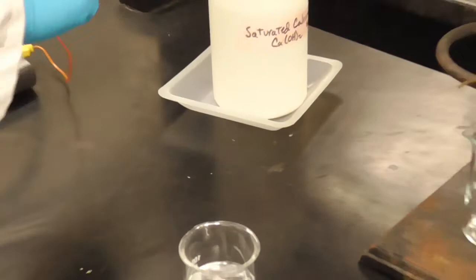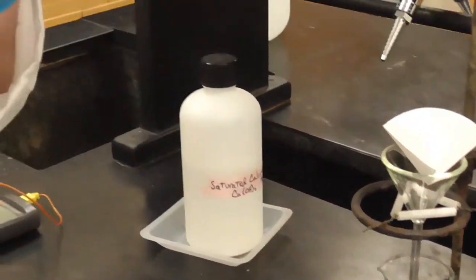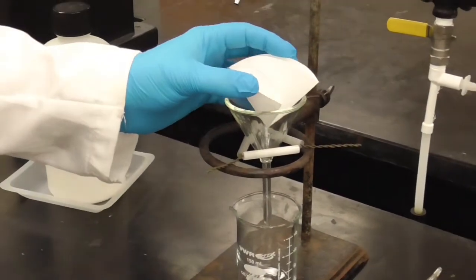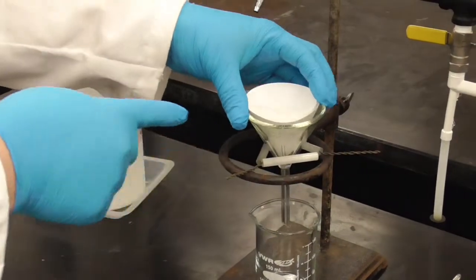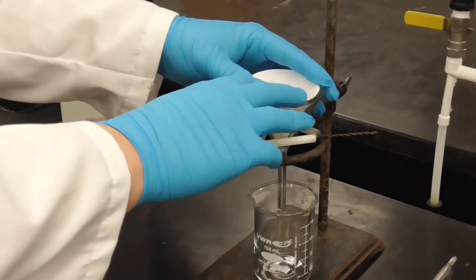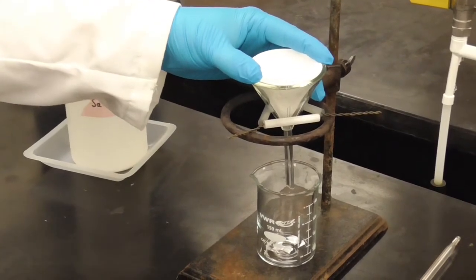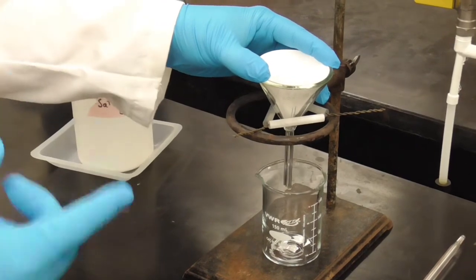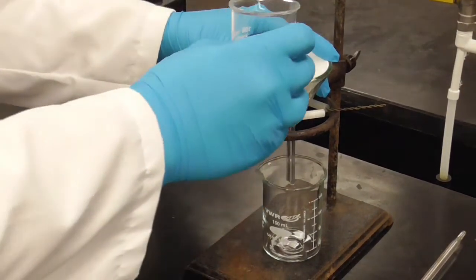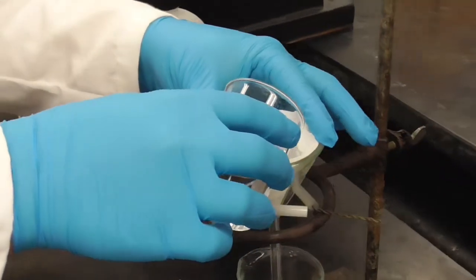And then it says to make sure that there's no solid floating around in here, we're going to make sure by doing a filtration, a gravity filtration. And so we have our piece of folded filter paper in our funnel. As you can notice, most of the time when we do filtrations, we wet the filter paper. We're not going to do that here because we don't want to change the concentration, right? We want it saturated. So we're just going to filter that.